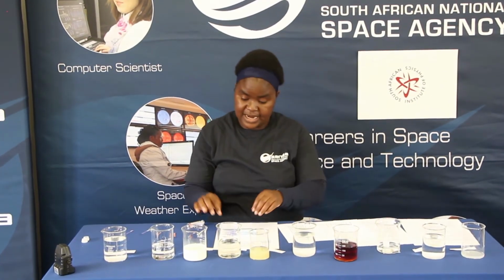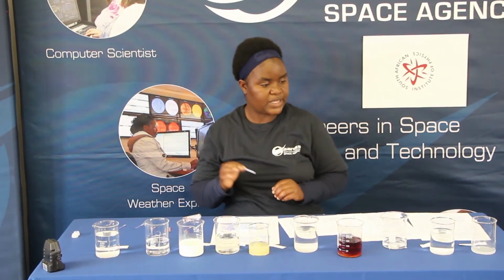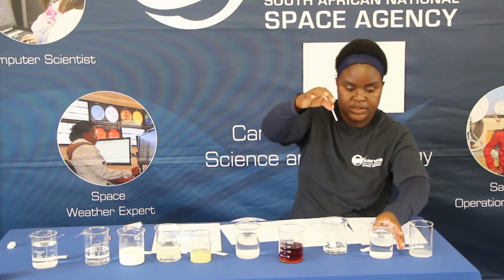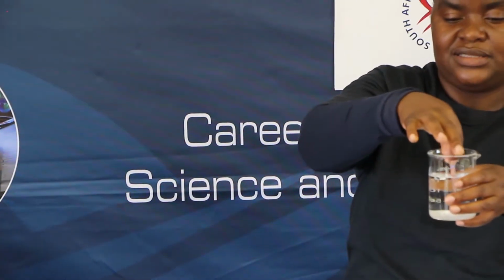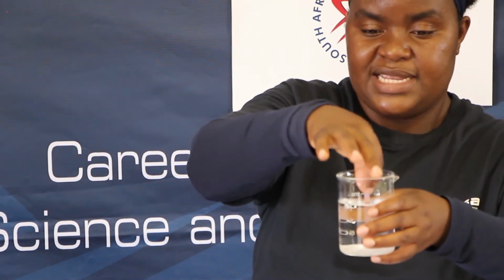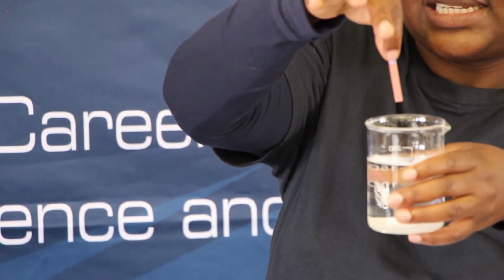And then lastly, we have a tartaric acid solution. So that is actually speaking for itself. It's an acid. So let's see what happens if we dip a blue litmus paper into an acid solution. You see? Can you see what happened? You can actually immediately see that the color changes. So what does it tell us? If you dip a blue litmus paper into an acid, you get a change in color and it is red.